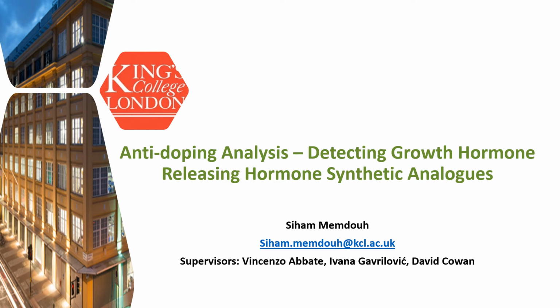Hello everyone, I'm Siham, a third-year PhD student at King's College London. I'm going to present our work taken to improve the detection of growth hormone-releasing hormone synthetic analogues for anti-doping purpose.